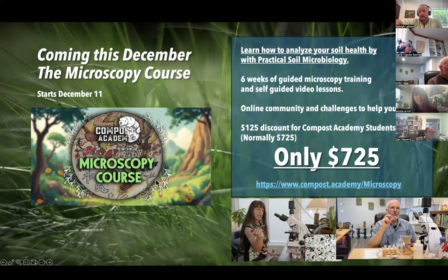So it almost feels like an apprenticeship in a lab. You'll be working with each other week by week for about 6 weeks through a 6 weeks guided microscopy training with Keisha and Brian. We're going to have different lessons each week, along with self-guided video lessons about how to use the microscope, how to use samples, how to do qualitative analysis, which is very important. And we're going to have an online community with challenges and feeds and things to help us out along the way.